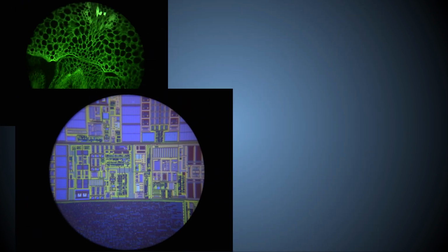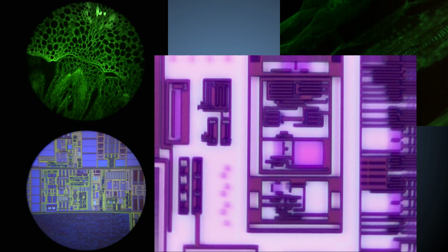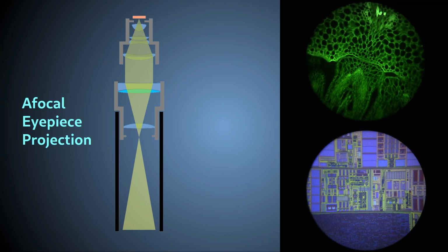Before showing you how to build the Epi-illumination modules, I'll demonstrate two practical Epi-illumination configurations of PUMA and show you some example images. These images are taken with low-cost CMOS cameras using two methods. The first is an example of the so-called afocal photography or afocal eyepiece projection. This takes the image that comes from the eyepiece and projects it through a complex wide-angle lens assembly of a camera onto that camera's sensor chip. This has the advantage of showing you the whole eyepiece field of view to give you a sense of what you'll see when looking down the scope by eye.